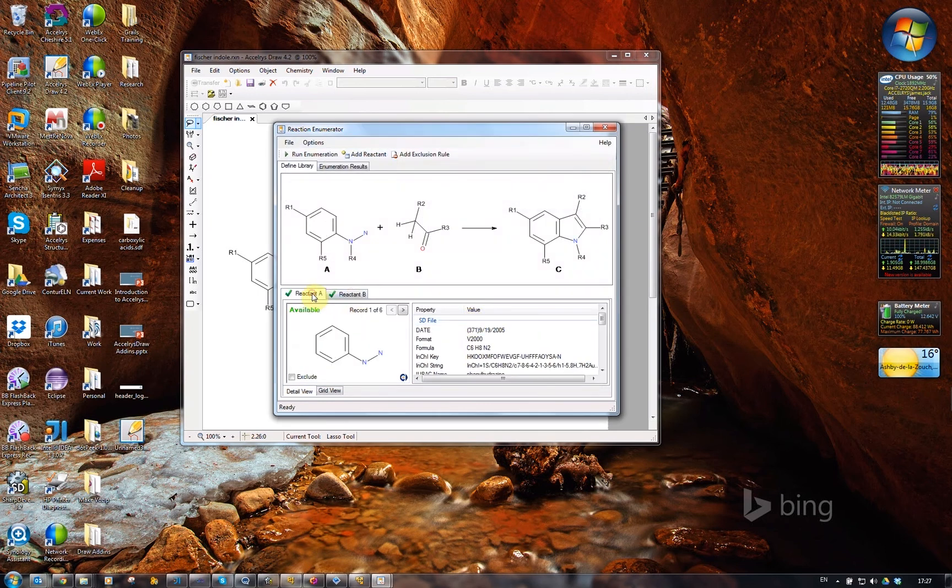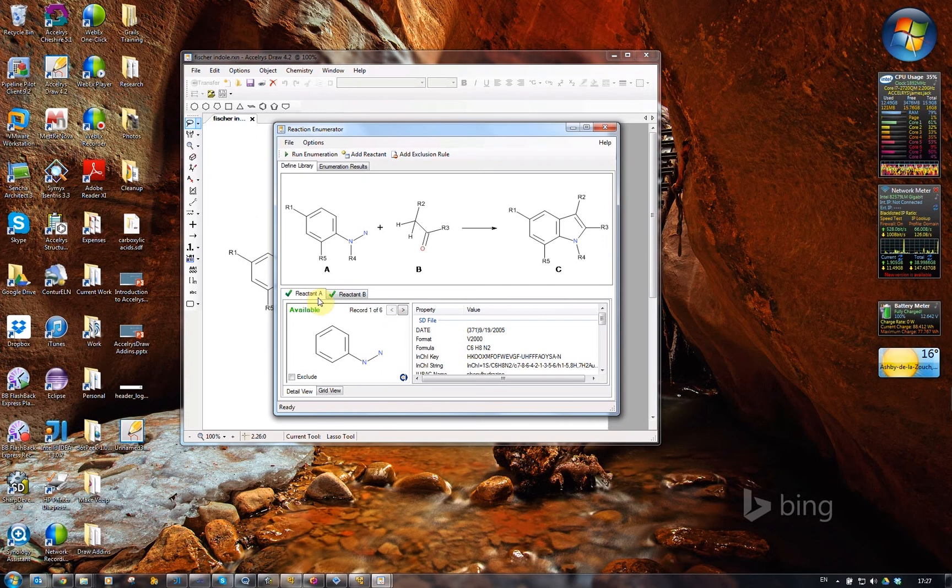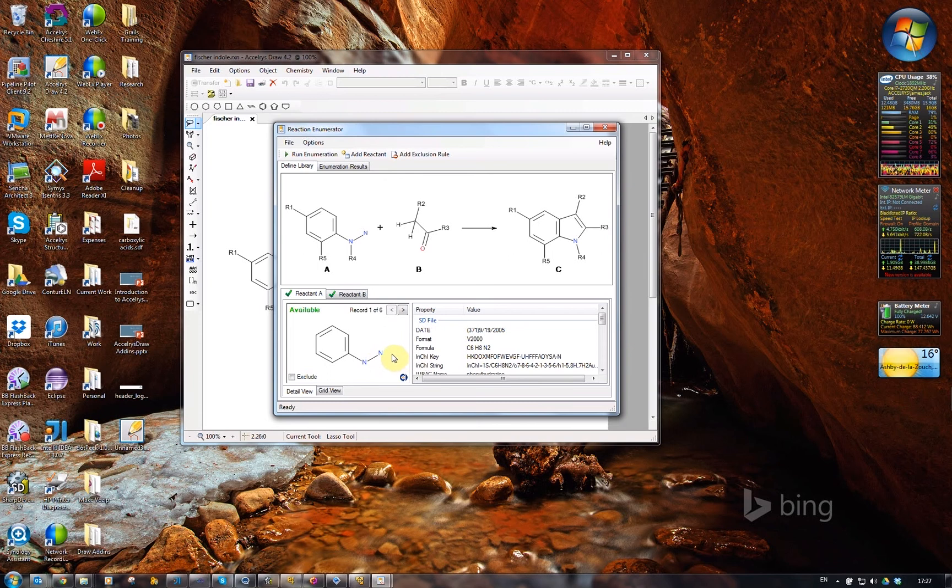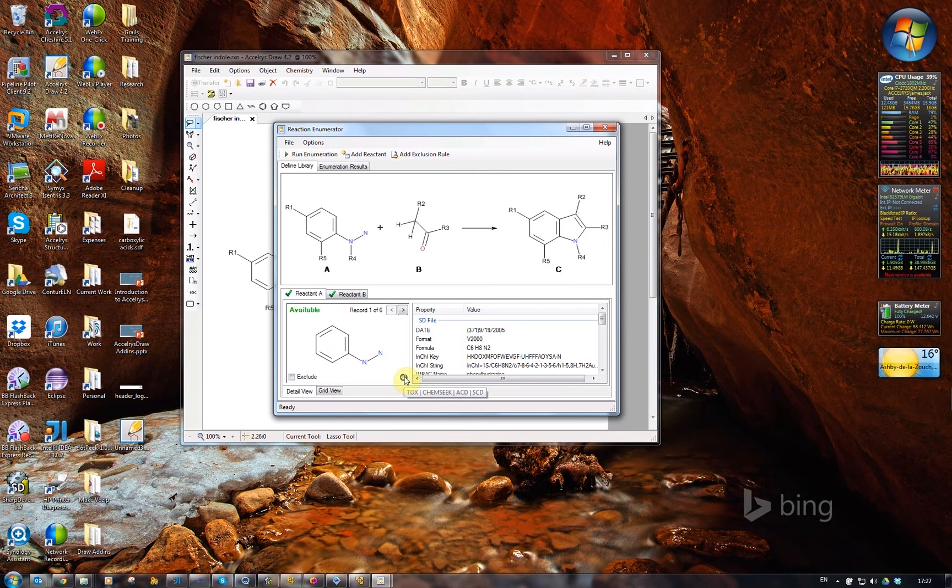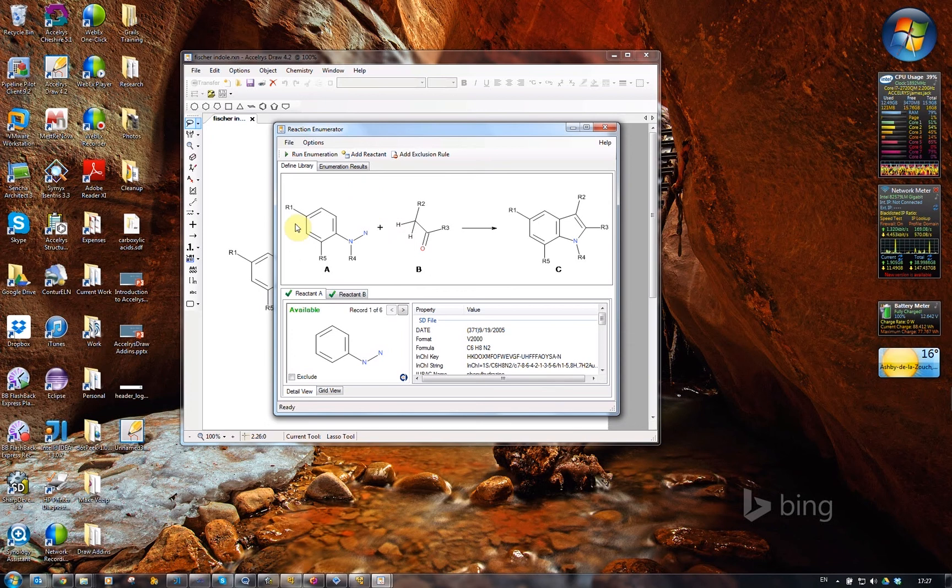It does some interesting trickery while loading these in. It goes off and checks to see whether these compounds are available using the DiscoveryGate web service. So it's telling me that some of these reactants are available, and if I hover over there, it tells me what databases they're actually in. Now I've loaded all the data that needs to be loaded.